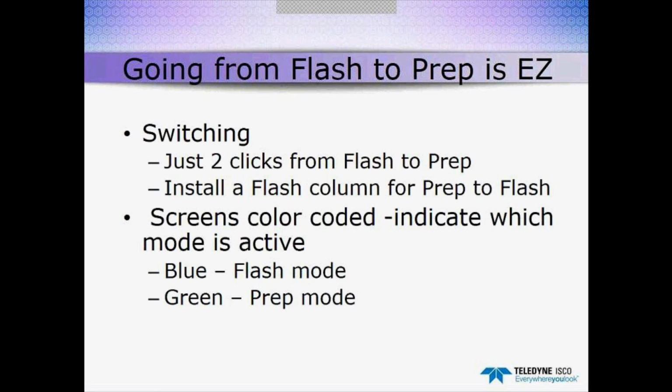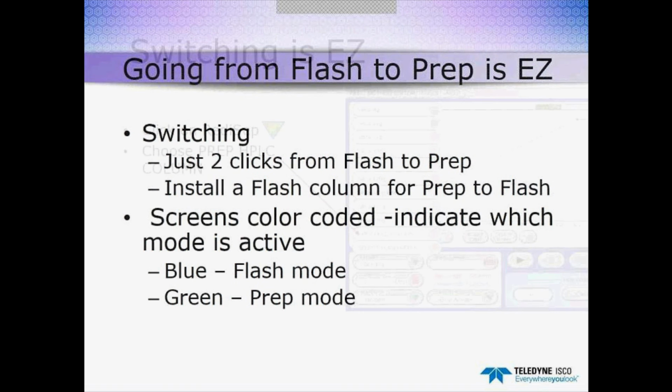In order to avoid confusion about which mode you're operating in, we've color-coded all the screens. So if the screen has a blue background, it's in a flash mode. A green background indicates that you're operating in the high pressure or high performance mode on the system.